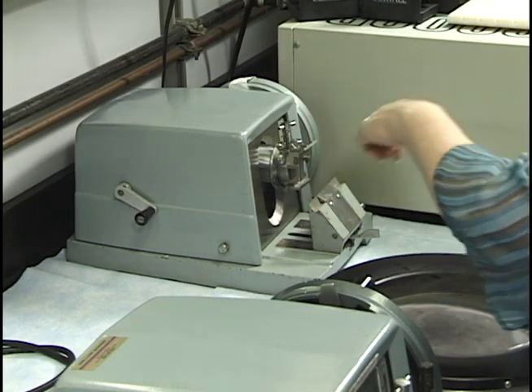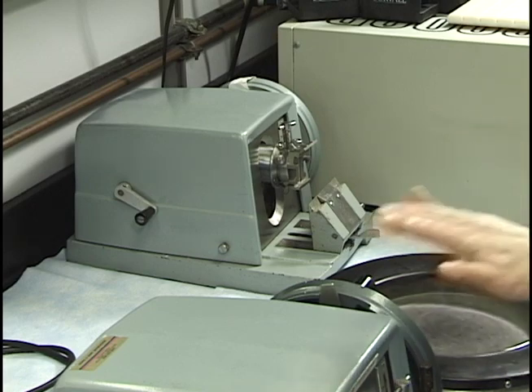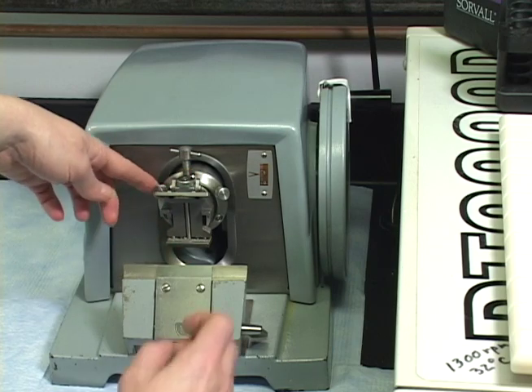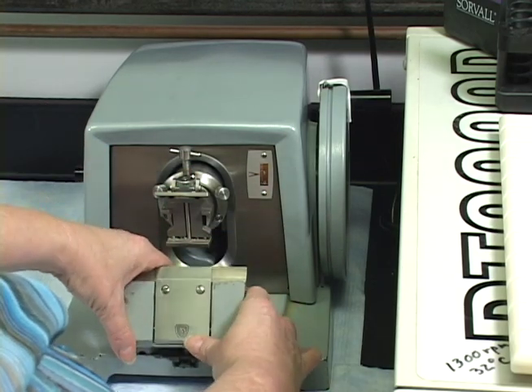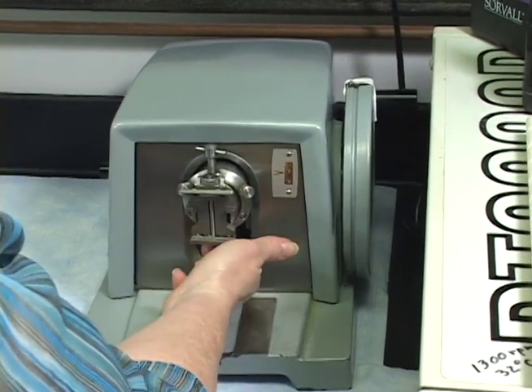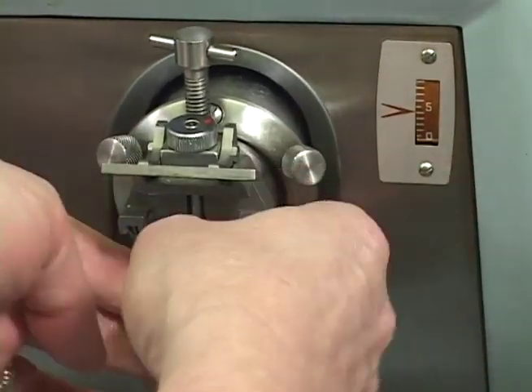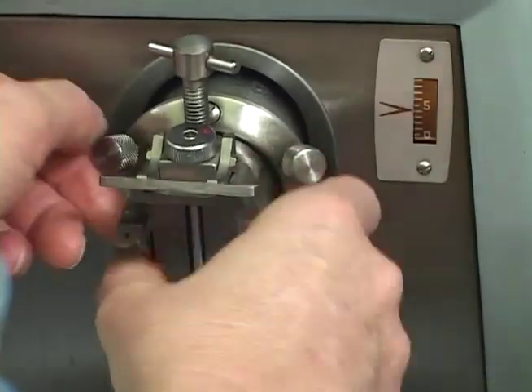Anyway, for your purposes, I wanted to show you how to adjust the tilting, the angle tilts and stuff on this microtome without adjusting our good one. So you can have an idea what I mean. You have 3 knobs. I'm going to remove the blade holder on this one. You have a knob here, and there's a knob underneath. And I'll remove this chuck just to give you an idea of what I'm talking about.